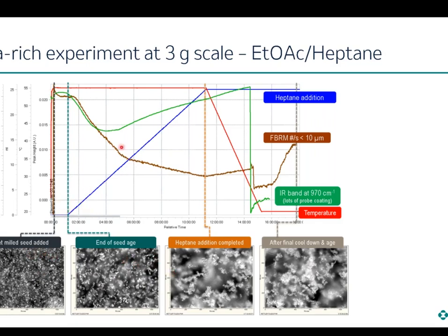And once we start adding the heptane over time, initially we see a drop in what corresponds to the solid concentration until it rises again. And there I have to say, this is more of an artifact. So there are particles or something else forming on the probe window, and therefore making this part of the signal not really useful until after the overnight crystallization. In the morning I wiped the probes, and that's where the actual solid concentration at that point decreased to.